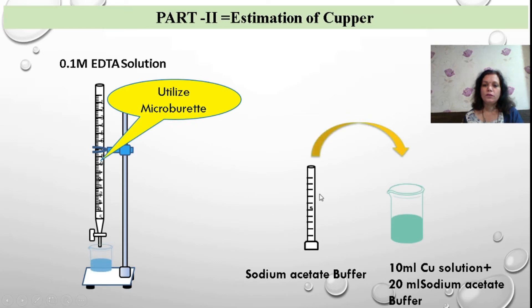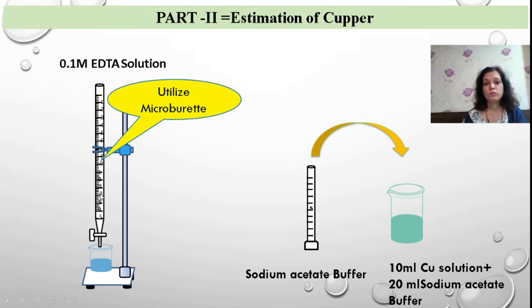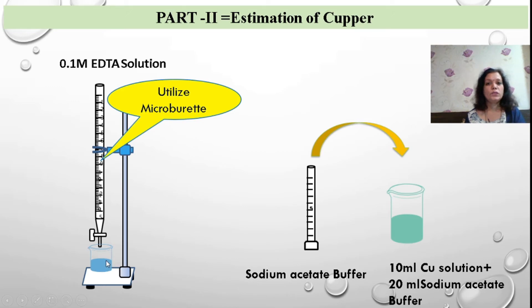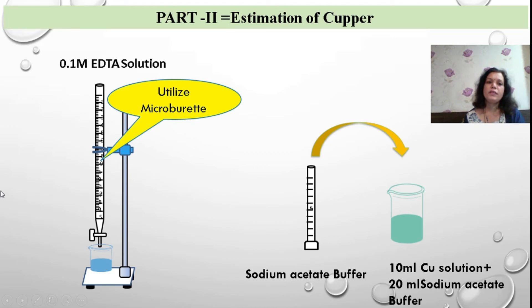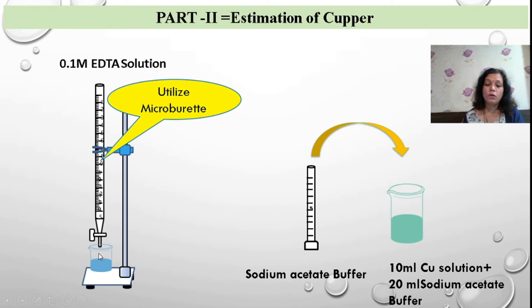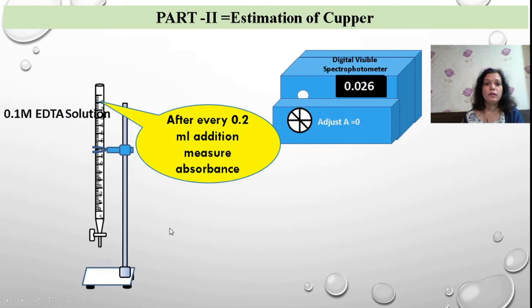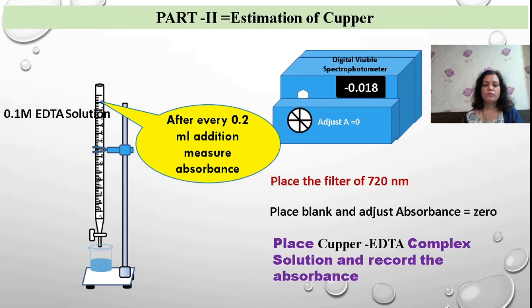The solution has been provided to you. Add buffer solution and keep the beaker ready under the burette, which is a micro burette, as you are going to add 0.2 ml of solution at a time — so use a micro burette for this titration. For the prepared solution, measure the absorbance at lambda max, that is 720 nanometers. After every addition of 0.2 ml of 0.1 molar EDTA solution, mix it, pick up in a cuvette, and measure the absorbance at 720 nanometers. Once you measure the absorbance, return all the solution back into the beaker. Repeat every time, measuring the absorbance at 720 nanometers.